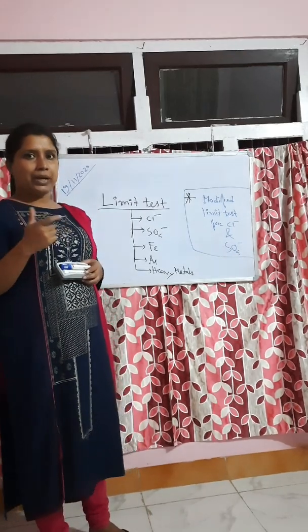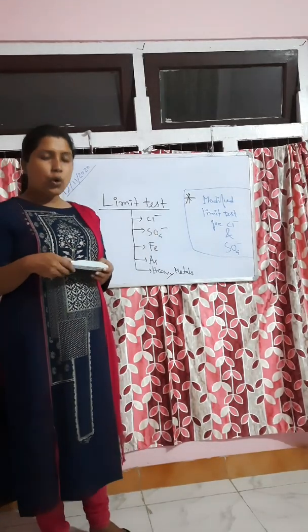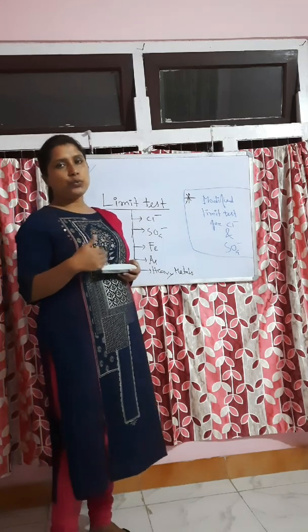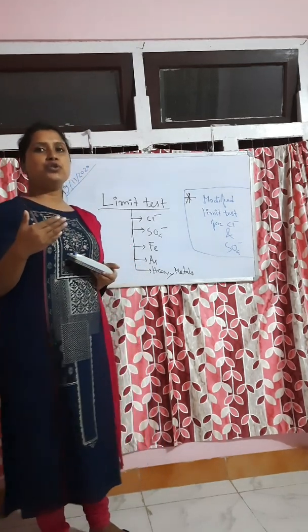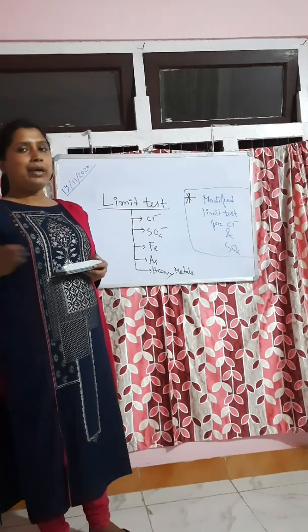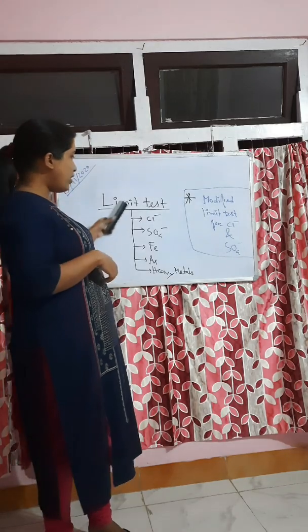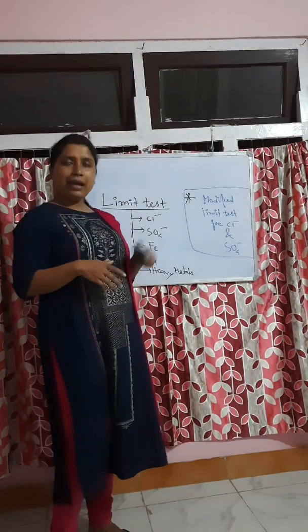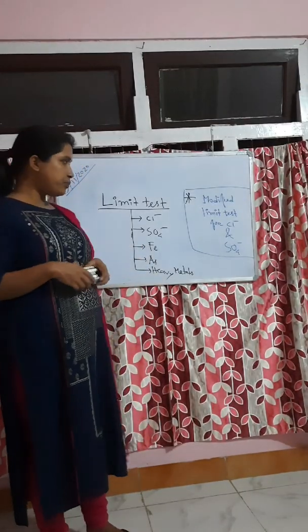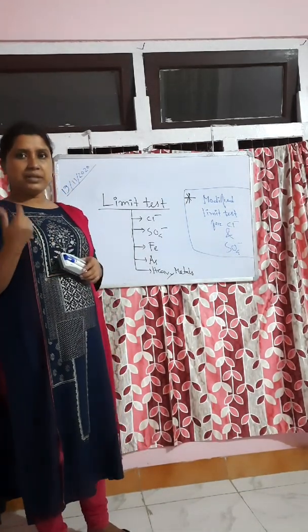From that reference we are doing this. So always when we do the limit test, we compare our test solution with standard solution, and then we come to the conclusion of the results. For every limit test there is a basis or principle.